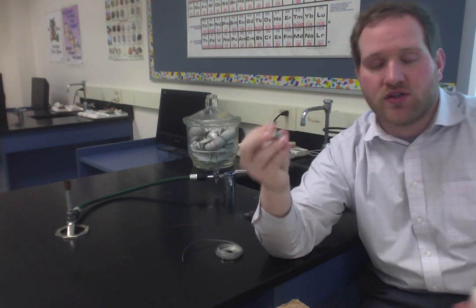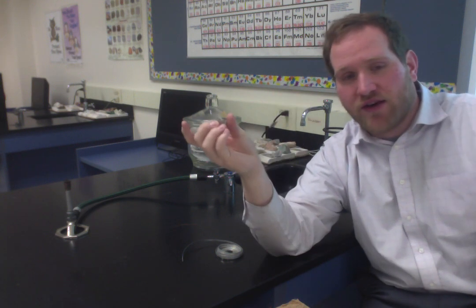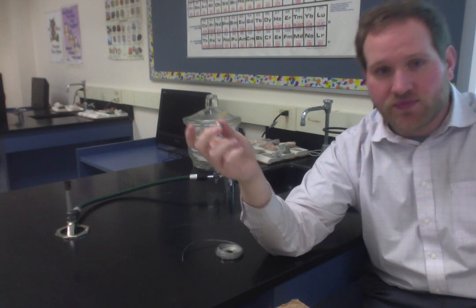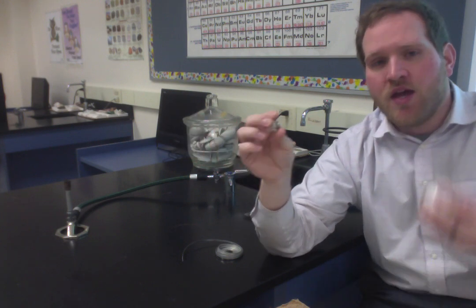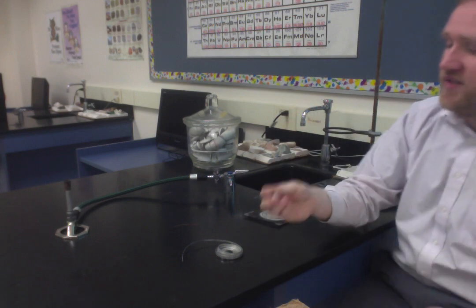So let's say the magnesium starts at 3 grams. You burn it, it's now 5 grams. How much oxygen bonded with it? 2 grams. Pretty easy. But when we burn this, we have to do it in a very controlled way for a few different reasons.